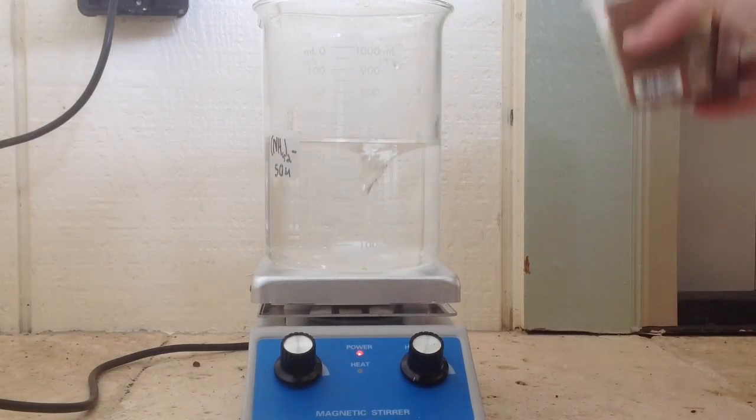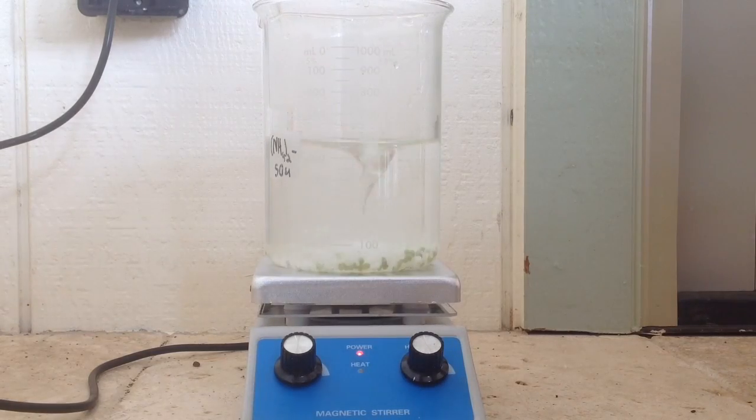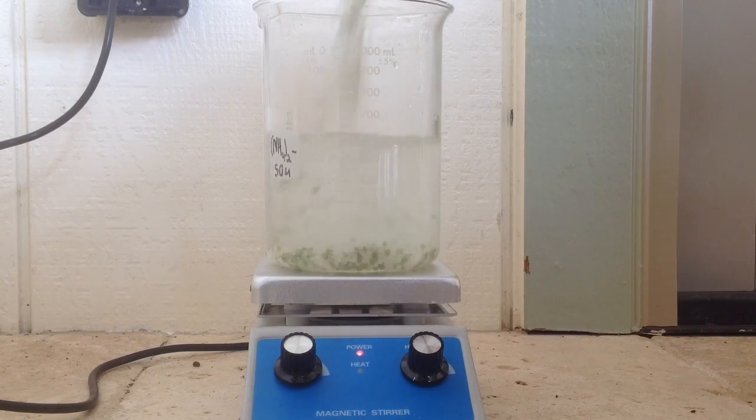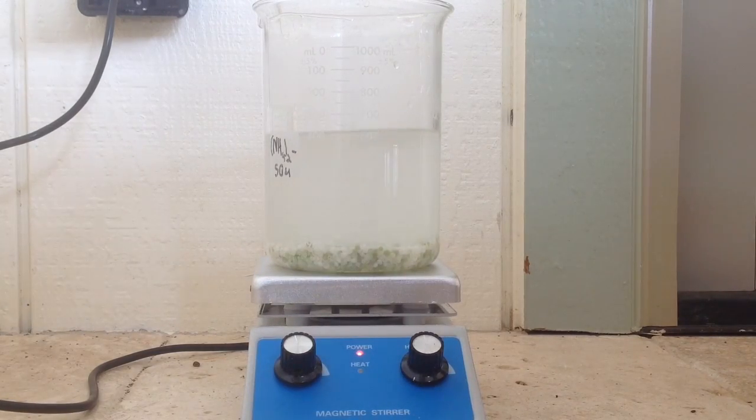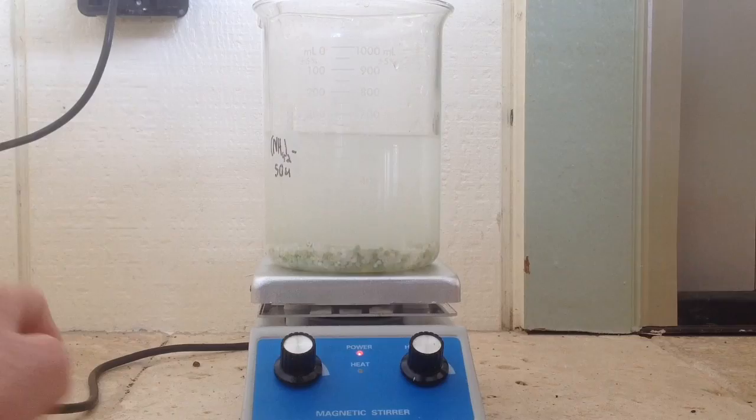Typically in home chemistry, recrystallization is used to purify an OTC, or over-the-counter, chemical using its known solubility and the other contaminants' known solubility. Today I will show you how to perform a recrystallization.